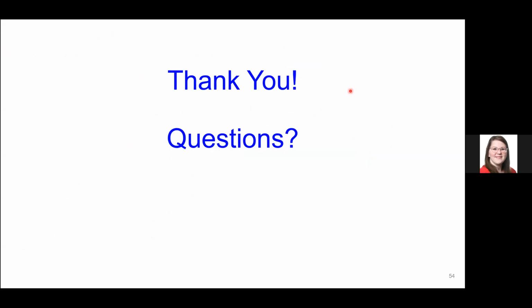So one of the first questions we received was, why stage position data collection? Why not use image beam shift to collect more data? That's exactly what we ended up doing.